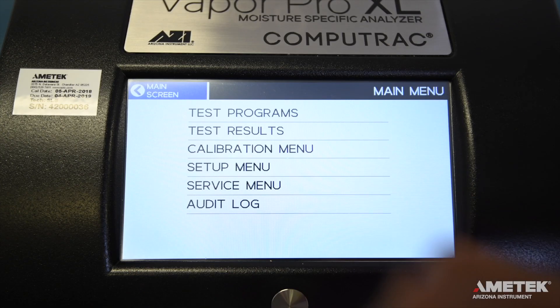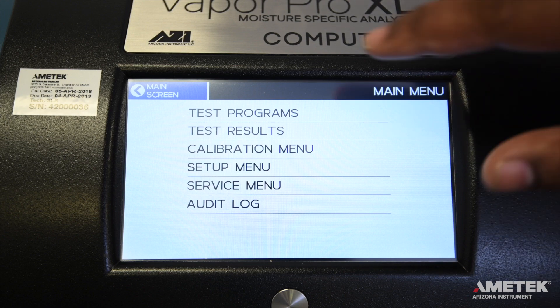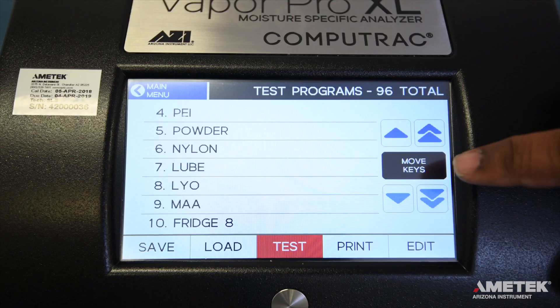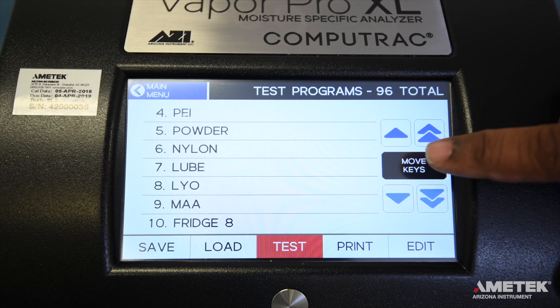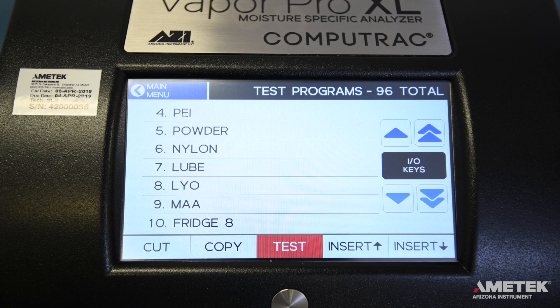To manually add a test program, touch the menu button on the bottom left of the screen. The first option you'll see on the main menu is Test Programs. Touch it to go into the Test Programs menu. Toggle the buttons on the bottom of the screen by touching the black button between the up and down arrow keys.